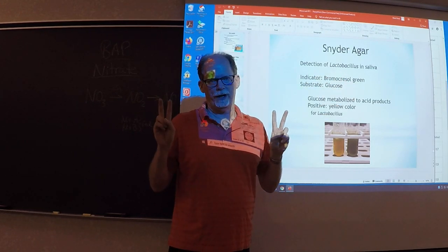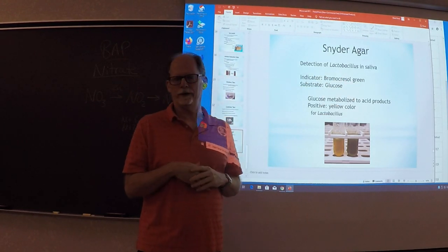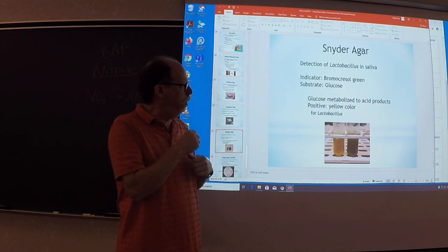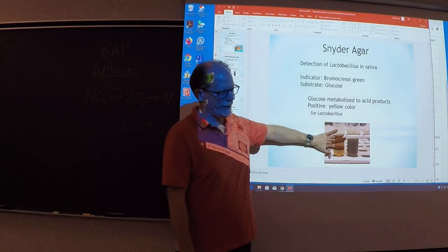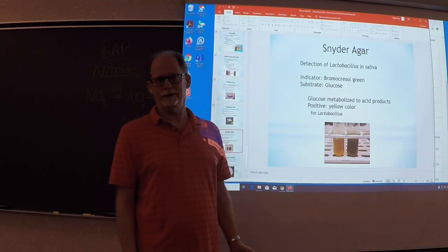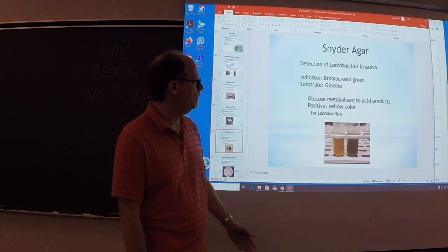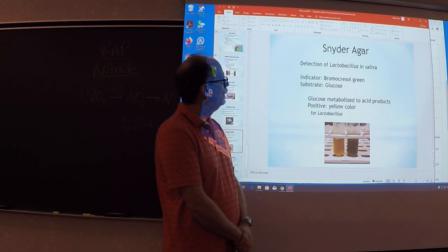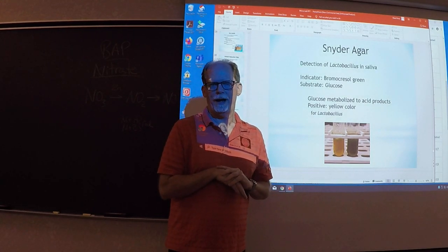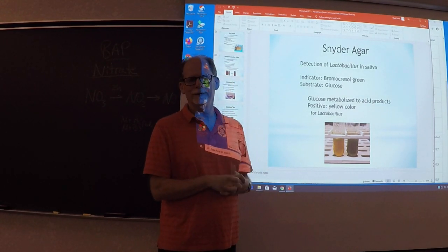Lactobacillus, or dental caries, are bacteria that can generate cavities, but that doesn't mean dentists ever use this to determine if you have cavities. So it's just a fun experiment to do in lab, if we were doing the lab. But unfortunately, you're having to watch this video of me explaining it.